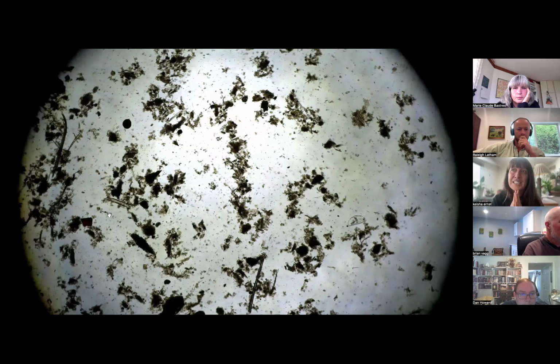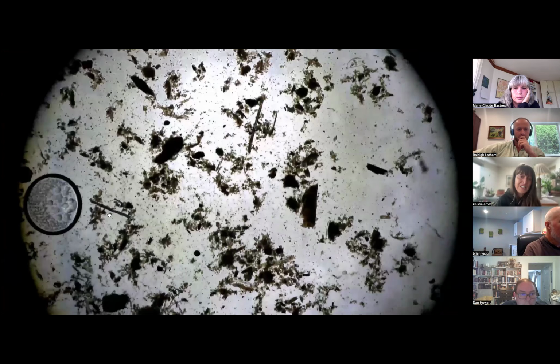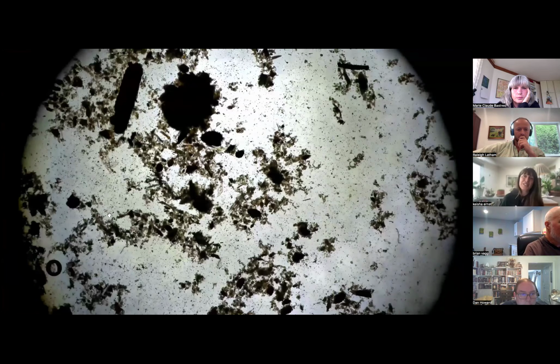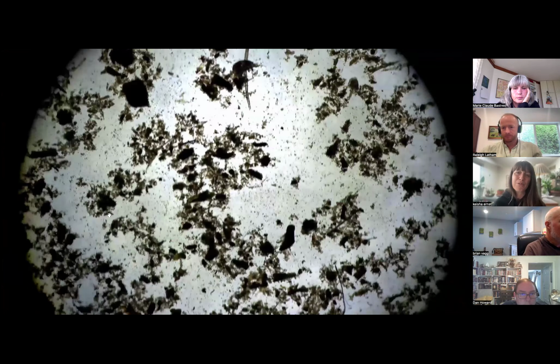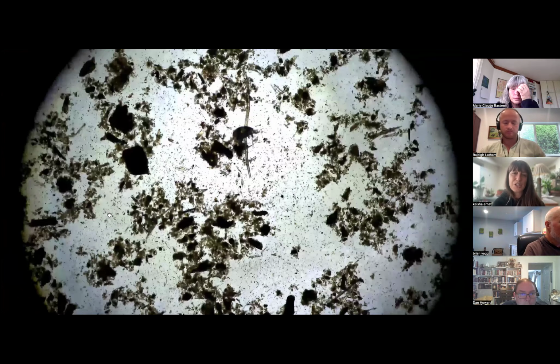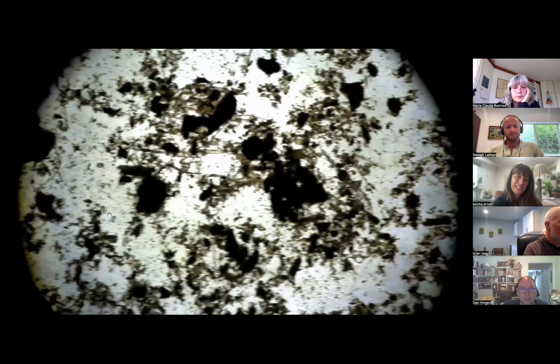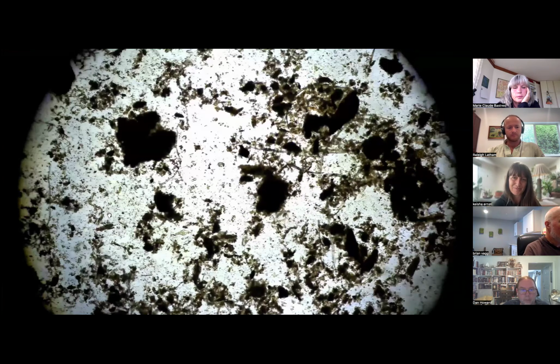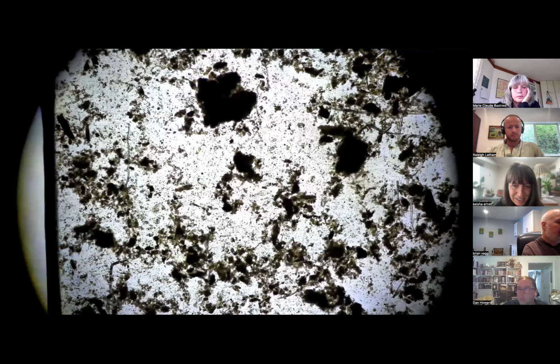And without looking at, say, DNA analysis, I would assume that a lot of these anaerobic ferments have great bacterial diversity and also ciliate diversity. And there's all kinds of organisms in there. But are they aerobic organisms? Because when I look at really good compost extract, it's quite boring. There's not a lot going on. It's not like things are moving around. And testate amoeba can just be slow. Fungi doesn't really move.